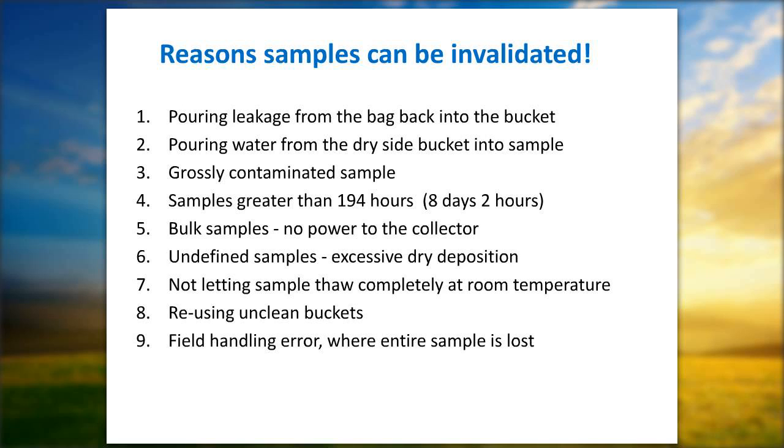Okay, going on to number 8, reusing unclean buckets. If you're short of buckets, we put notes in them, the next to last, about you're coming up on your last bucket. Don't ever reuse an unclean bucket, one that was on there for the previous week. We can get you supplies pretty quick. If you let us know, we've overnighted some supplies, so please let us know. Don't attempt to reuse unclean buckets.